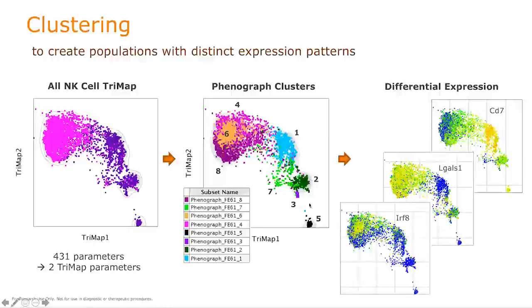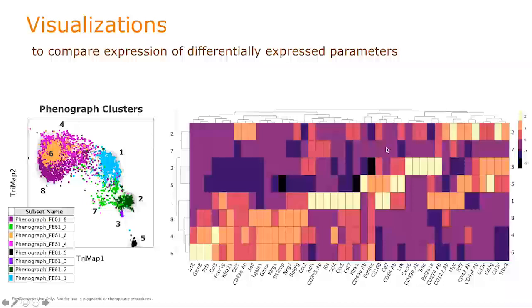In this case, I'm using Phenograph, feeding in all the parameters, and then doing differential expression across those different clusters and finding the unique RNAs and proteins that confer an actual feature set, a unique expression pattern for that particular population within your system. I'm casting a wide net here, but I've got more markers defining these 8 clusters than I can even fit in a multicolor flow cytometry panel. And the only way to do that is to go into single cell omics.